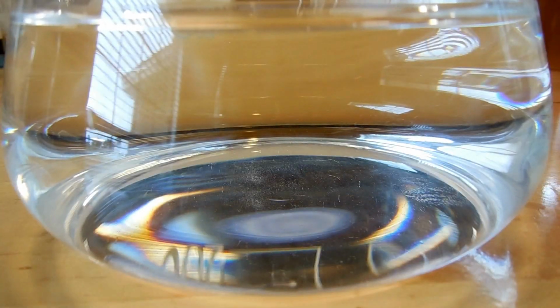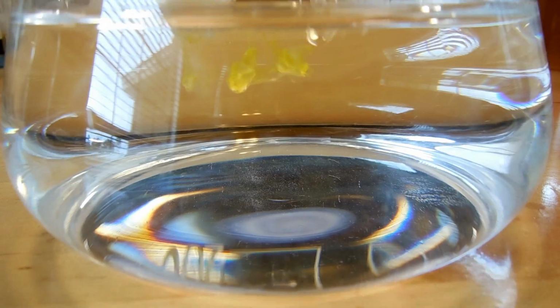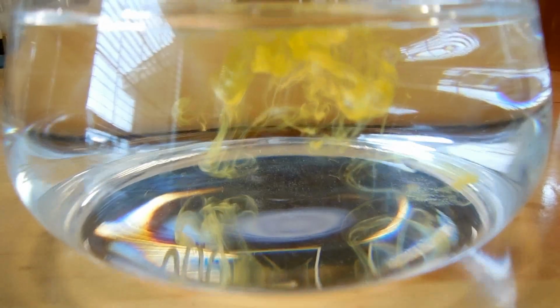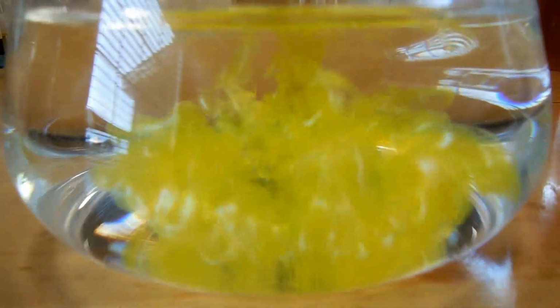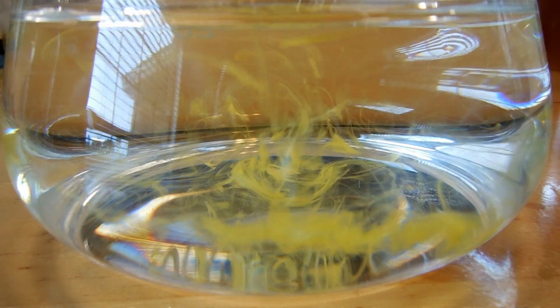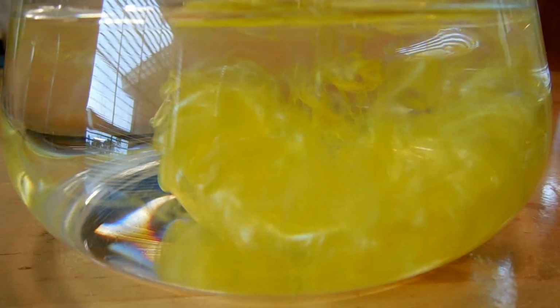All right, we're ready to begin. So this is the lead nitrate solution on close-up, and I'm going to start by just pipetting in a small amount of the potassium iodide solution and see what it does. That's gorgeous. Let's do some more. Wow, that's a really beautiful yellow.